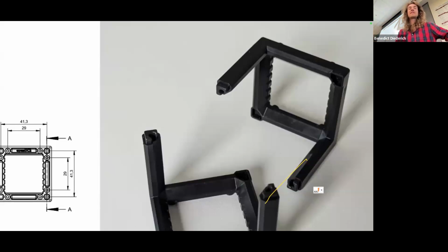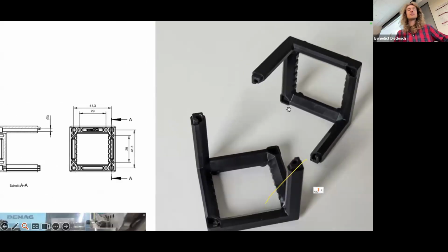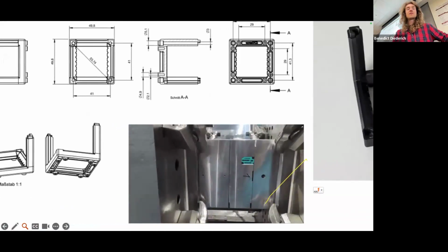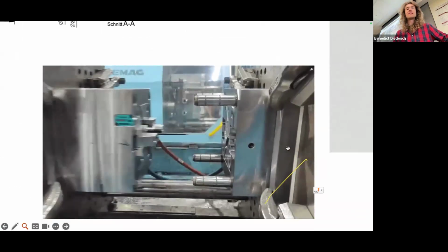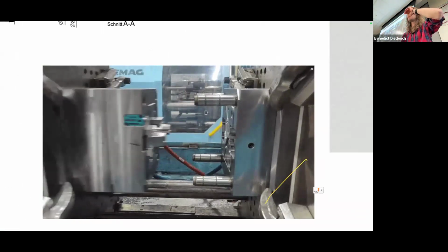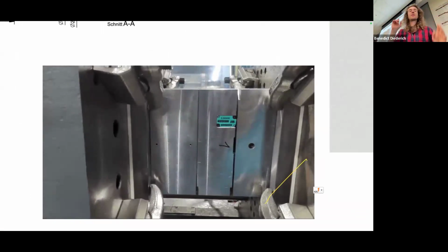So these grooves should resolve this problem, so that you have some male fitting that fits into the groove, like a V groove, and then you don't have this wobbling anymore, and everything is a bit more stable. So these are some improvements. We've bought new molds. It's crazily expensive, but it's producing now day and night. I think we're reaching 50,000 cubes now, and that's almost coming back to the quantum bit.